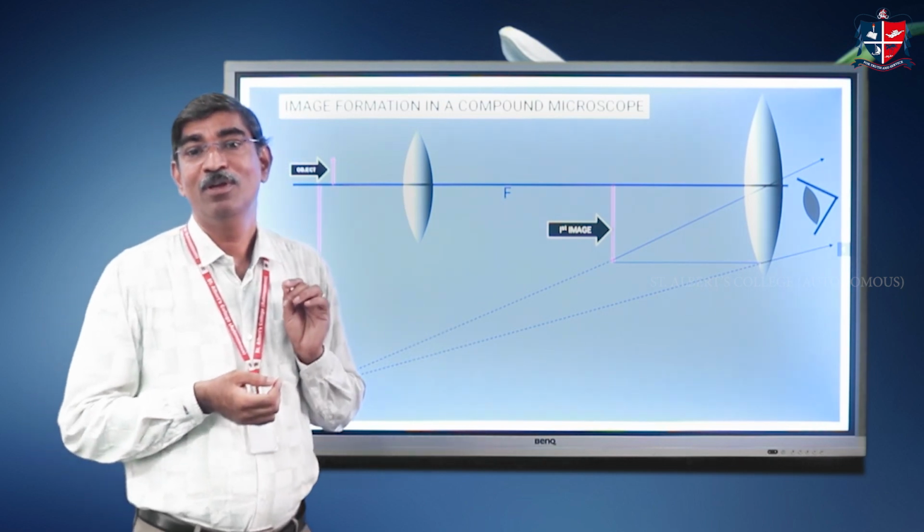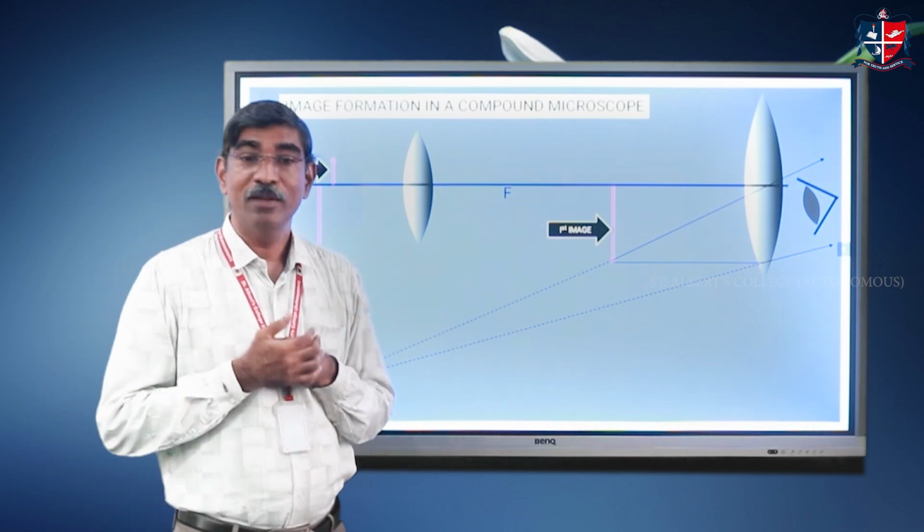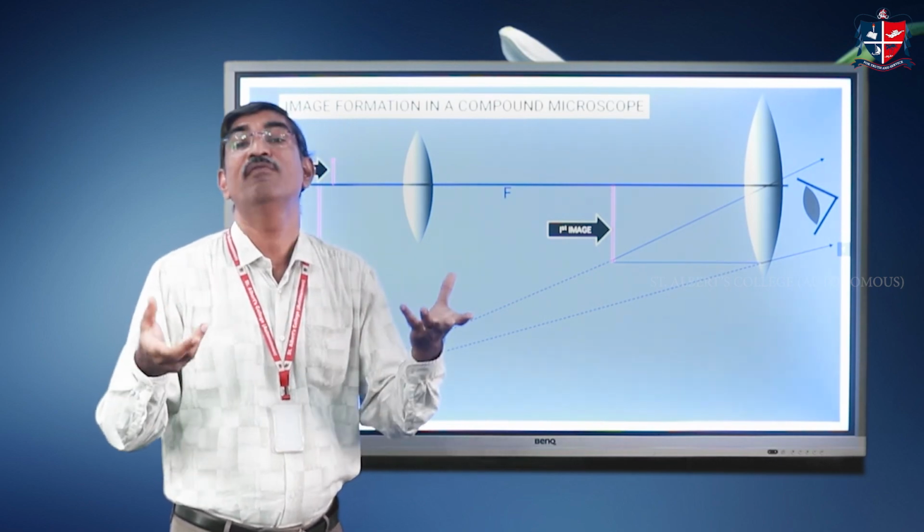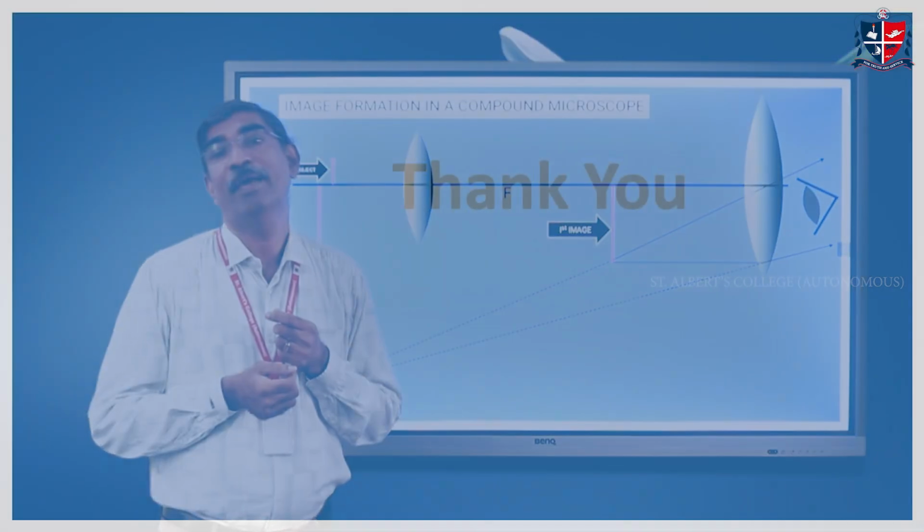So I hope you are now thorough with the basics of magnification in a compound microscope.